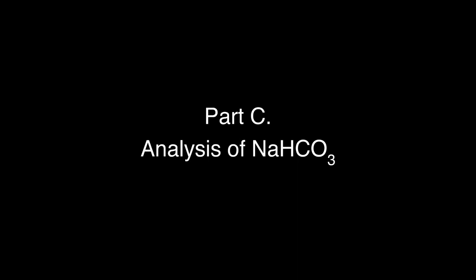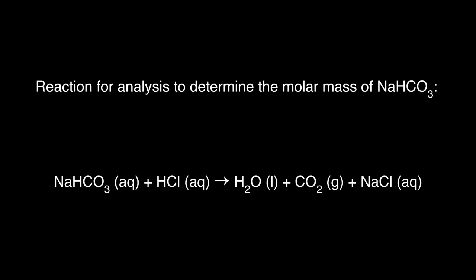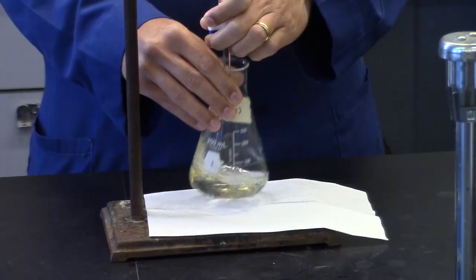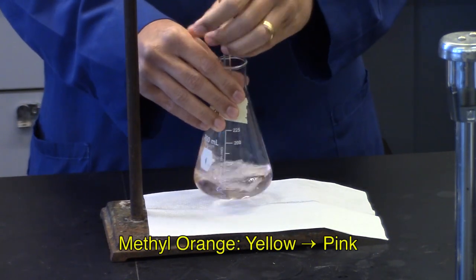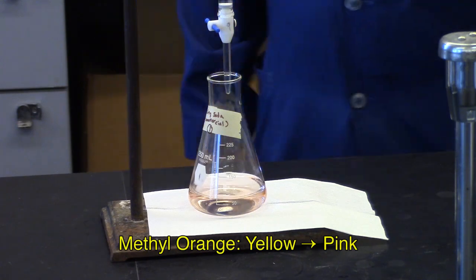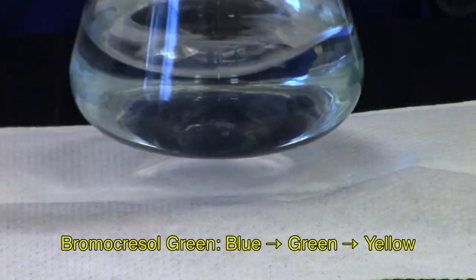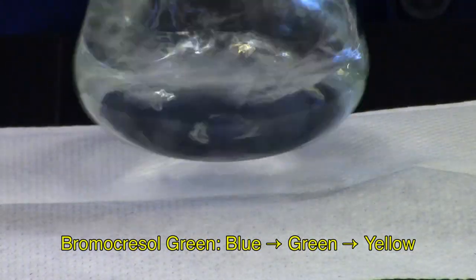Part C. Analysis of sodium hydrogen carbonate. Reaction for analysis to determine the molar mass of sodium hydrogen carbonate: Sodium hydrogen carbonate plus hydrochloric acid goes to water plus carbon dioxide plus sodium chloride. Equivalence point occurs at around pH equal to 5. So either methyl orange or bromocresol green will be used as an indicator for the titration.